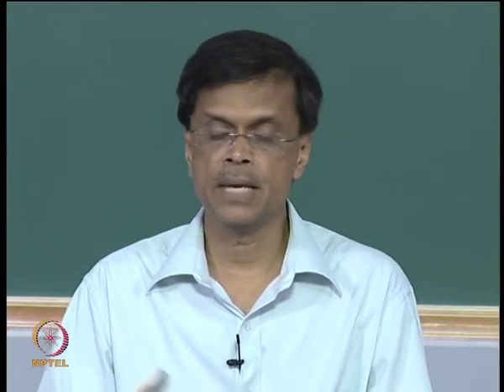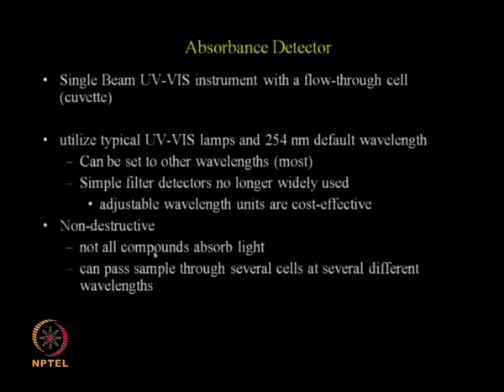So in that case we do this HPLC, collect all the sample, take it back, and maybe perform some other analytical tool. That is the main advantage actually. But the disadvantage is that not all compounds will absorb light, so that is going to be a problem.